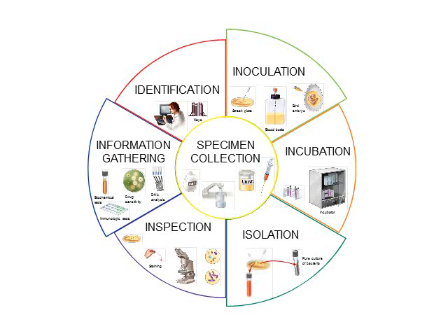So usually after you collect your specimen, you inoculate some type of agar plate or some type of media, or it can even be like a live inoculation, so in a bird embryo, for example. So we need to inoculate some type of media. We then go down towards incubation. So we're going to go clockwise around the circle. So after you inoculate your sample, you have to incubate it. So this allows the sample to grow over time. And we'll be working with incubation quite a bit in lab.